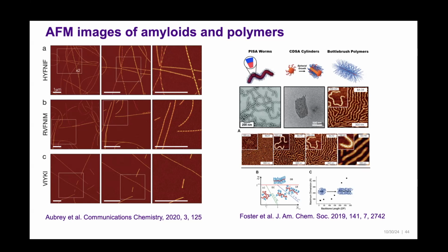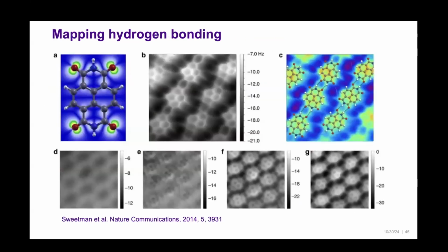And here are synthetic polymers, polymers which have a lot of brushes. When you assemble them, they form these worm-like structures. You can see the polymer brushes here, the worm-like structures. Maybe it's not possible in many techniques other than TEM and AFM. And with AFM, you get the beautiful topography. So you can really see the structures, any structure that is made or naturally existing, with the AFM.